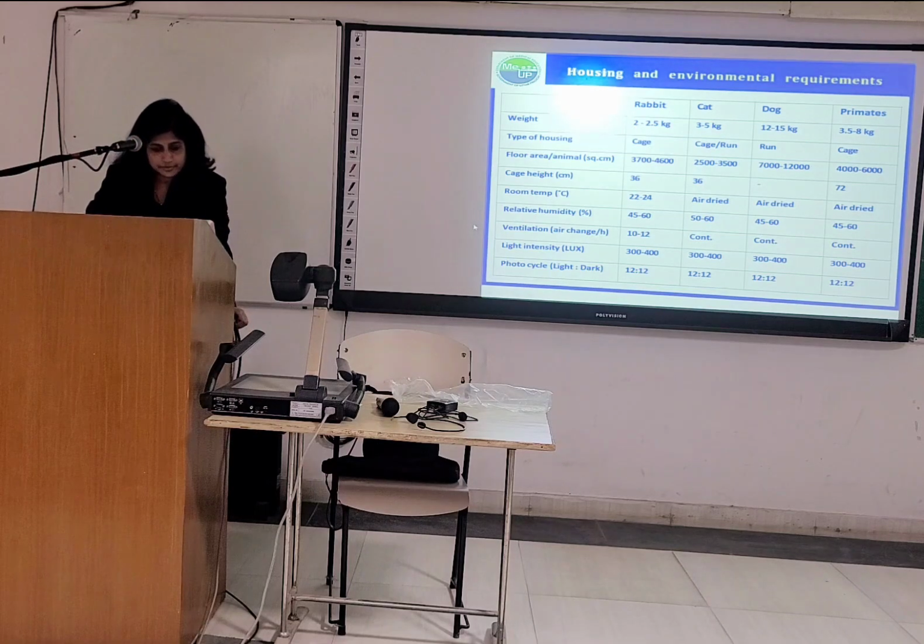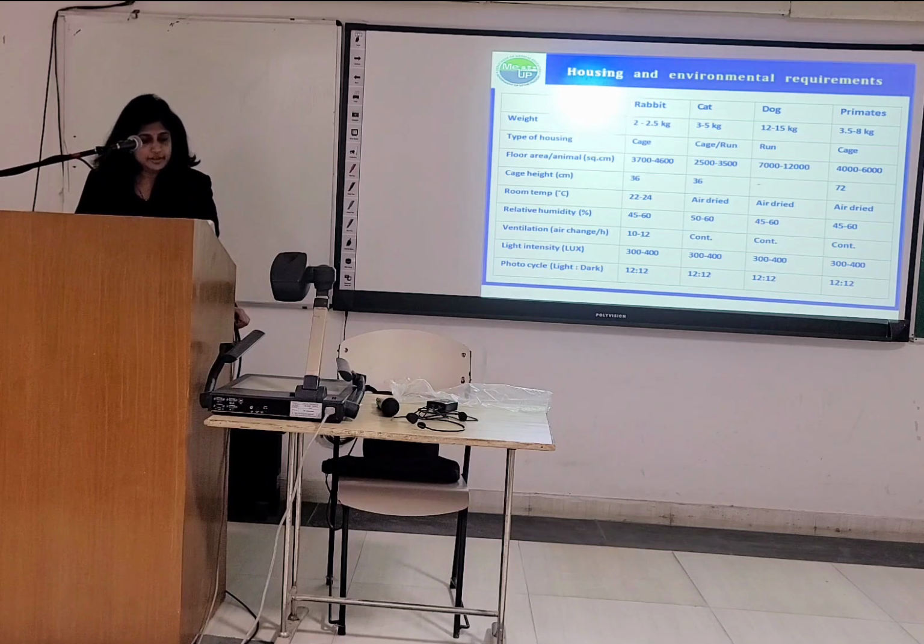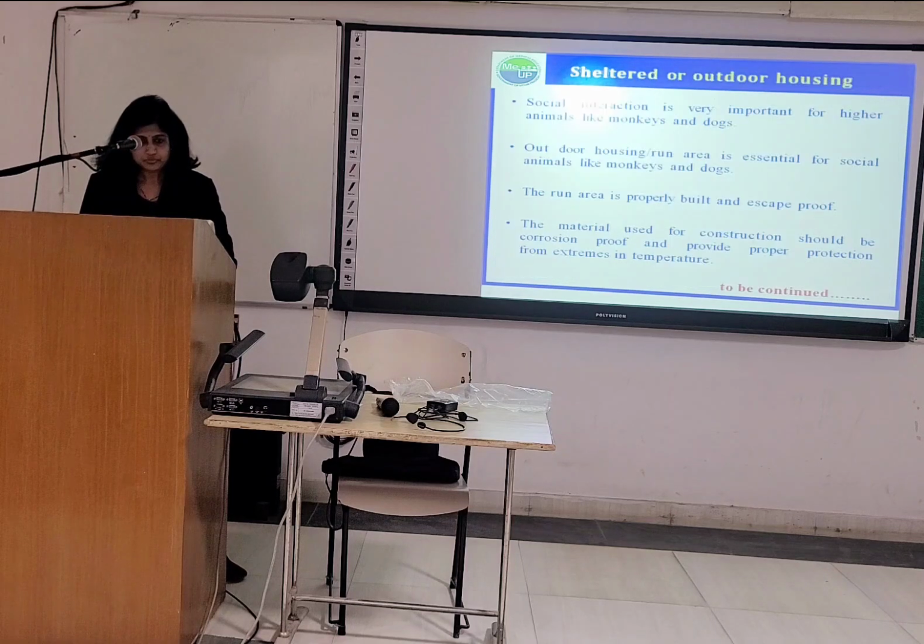others is air-dried. Relative humidity 45 to 60% in case of rabbit, dogs, primates, and it is 50 to 60% in case of cat. Ventilation 10 to 12 air changes per hour for rabbit, and it is continuous in other species. Light intensity same, 300 to 400 lux, and photocycle light to dark period is 12 hours.